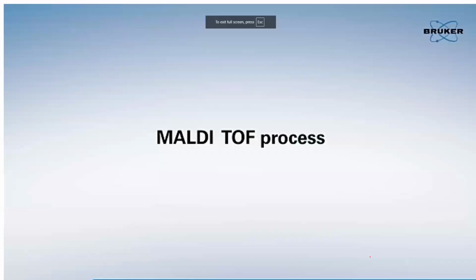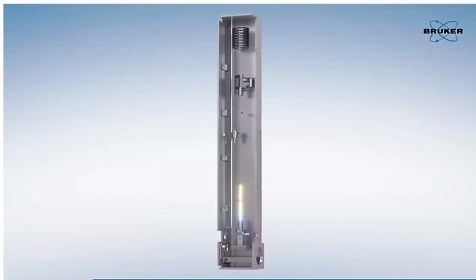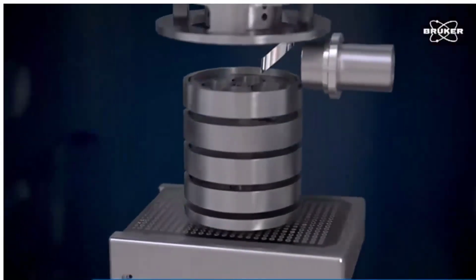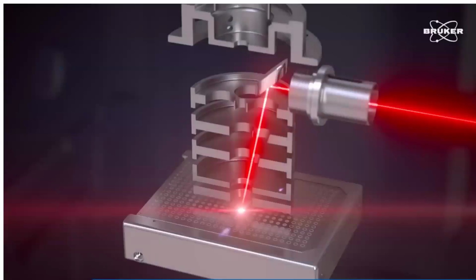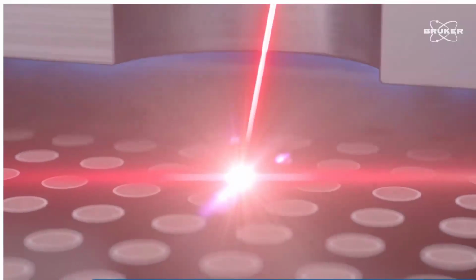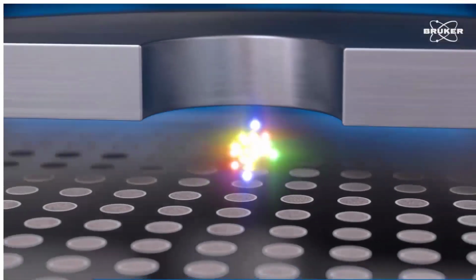This is just, I think, for someone who didn't understand. So this is your simple setup. You have your sample, right? And then ions will be moving.